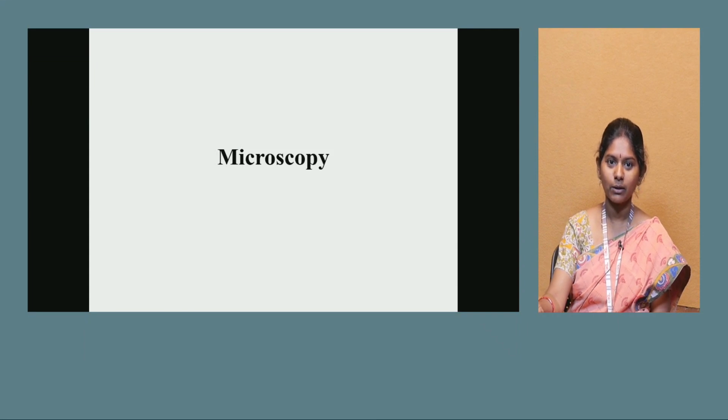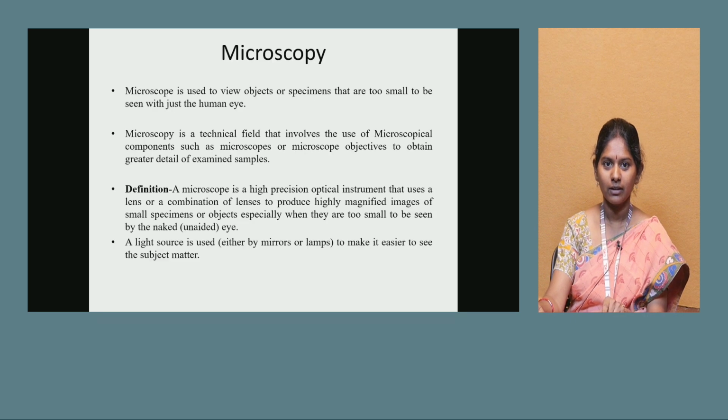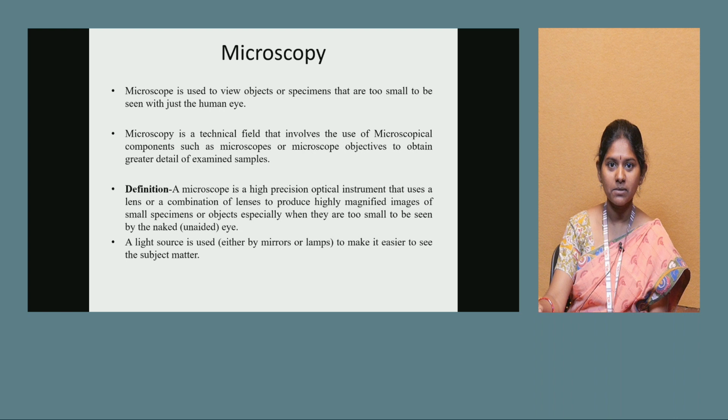Today we'll discuss microscopy. We all know that a microscope is used to view or observe objects or specimens that are too small to be seen with just the human eye. So microscopy is a technical field that involves the use of microscopical components such as microscopes or microscope objectives to obtain greater detail of examined samples.